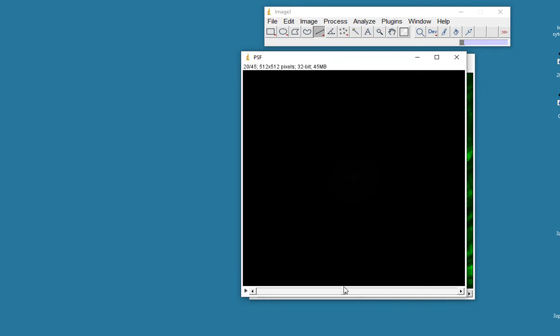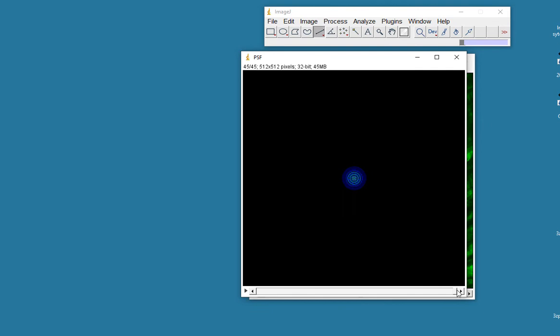There's a little dot here, looks like there's something here, some kind of point spread function in there, it's really quite difficult to see it. I find that if you use a lookup table, a 323 lookup table, it shows you the point spread function quite nicely. So this is an estimate of the way in which light emanates from a point within the microscope which we've used to collect this data. So this is an estimate of the point spread function.